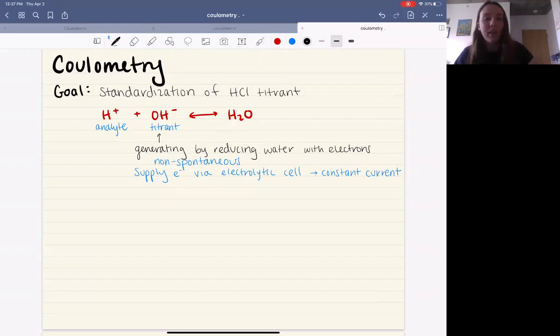let's start off by thinking, if you plug something into the wall outlet, it outputs AC current. It's oscillating back and forth. It pushes some current and then goes back, goes like this. But if we want to supply a constant current, we can't have this pushing force. Instead of using that alternating current, we need to use direct current. So the very first step of our circuit is going to have an AC to DC converter.